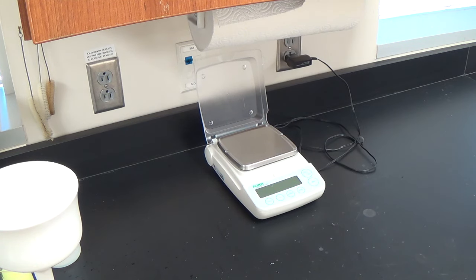From there you can use the molar mass to find the moles of the solid, and from there you use stoichiometry to find the molarity of the calcium ions in the tap water. And then I have a chart for you that turns it to parts per million, and you compare and tell me what the hardness level of our tap water is.